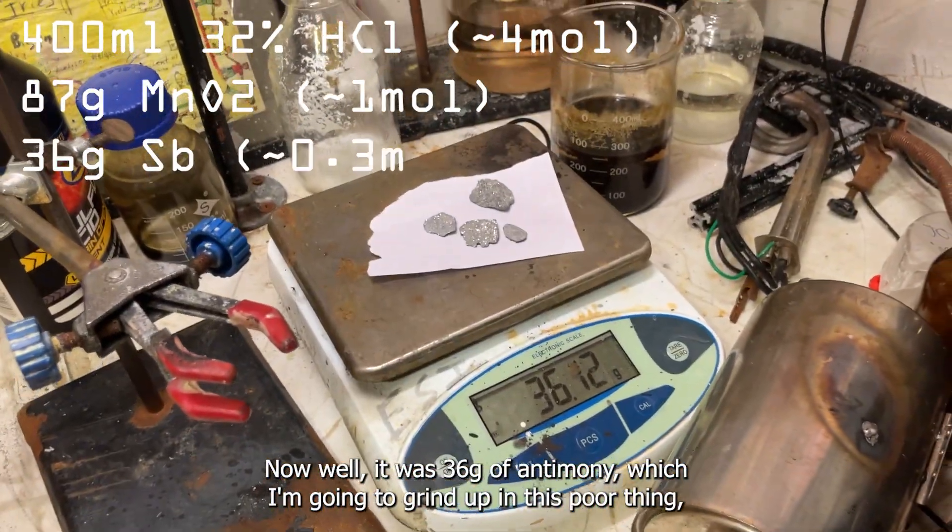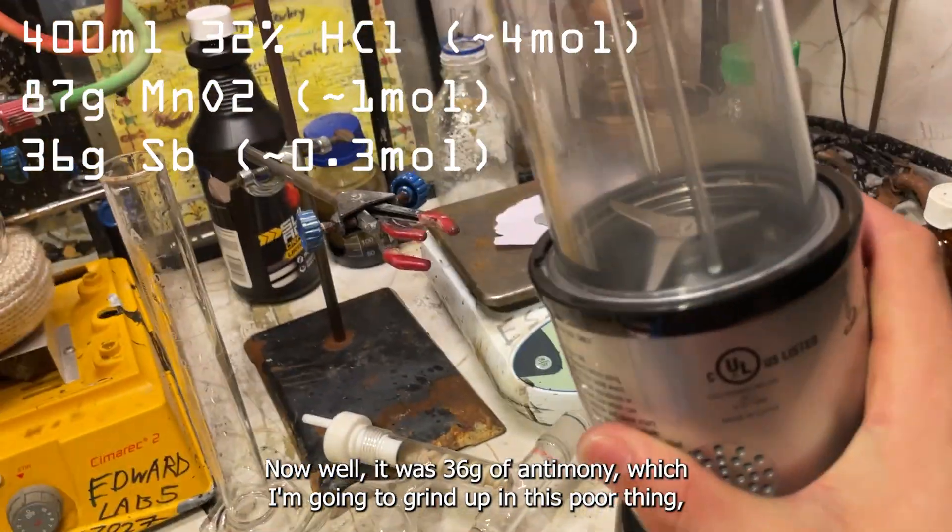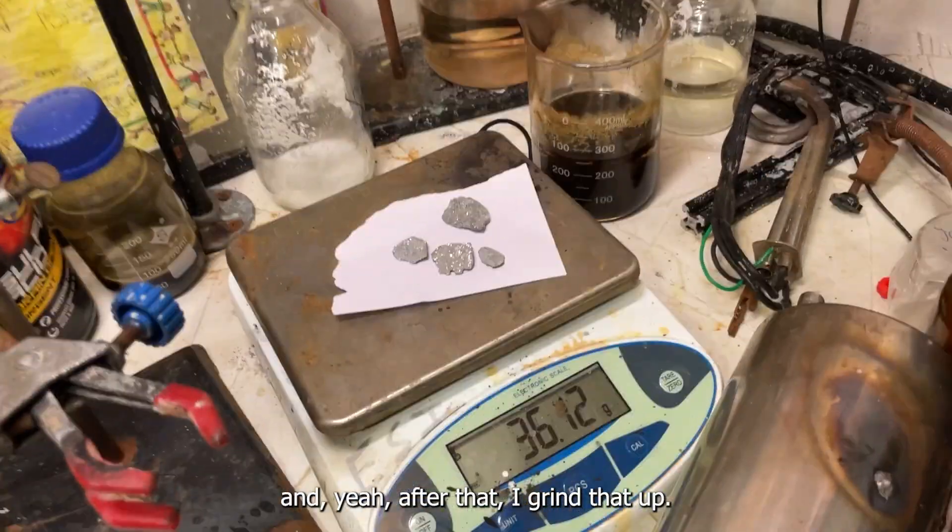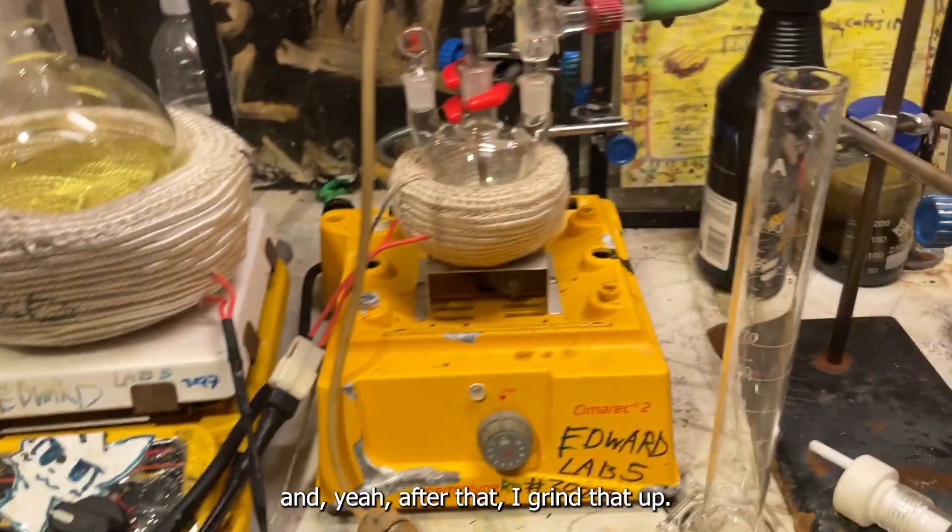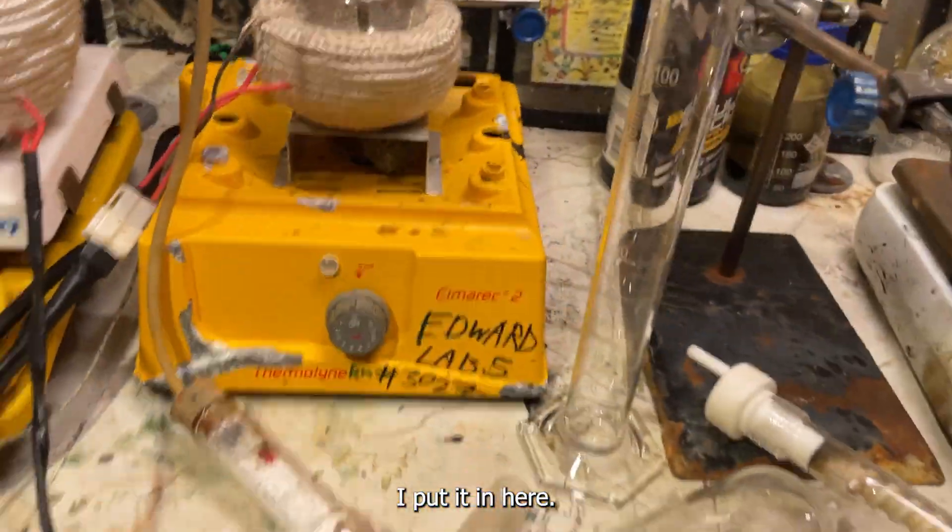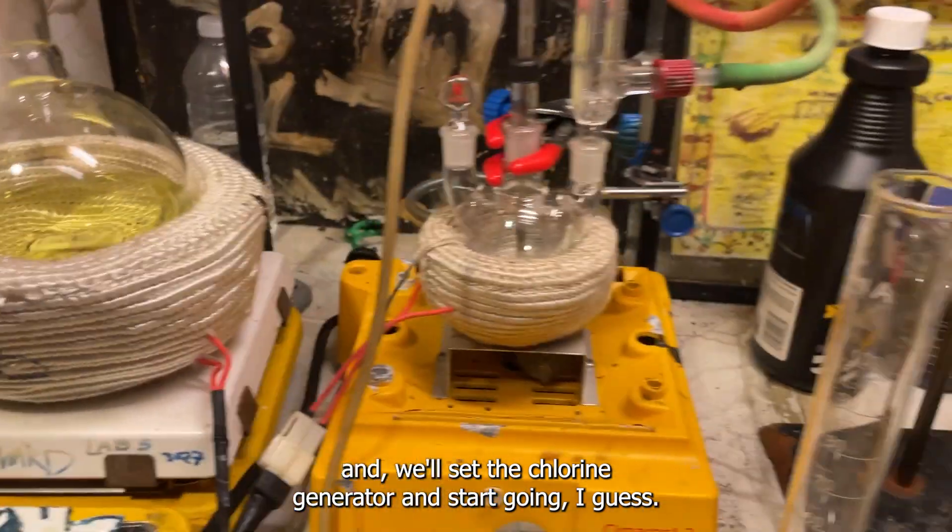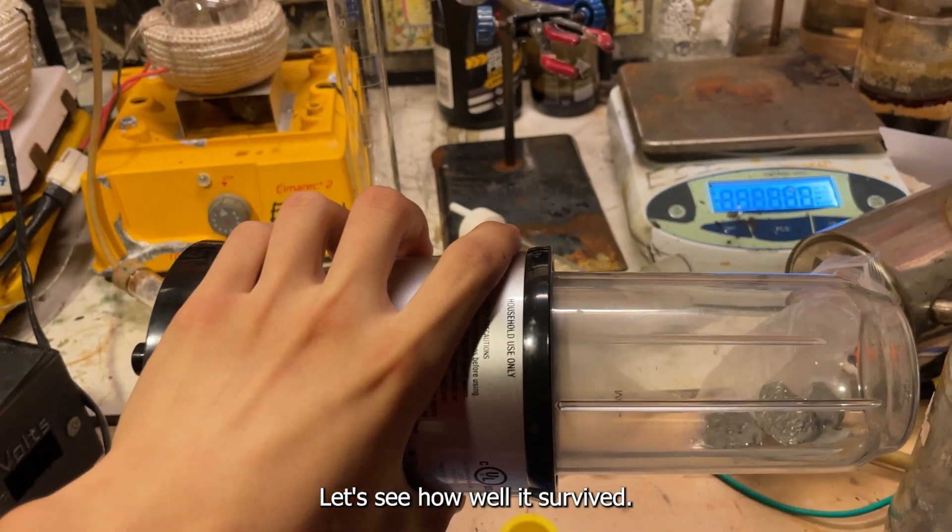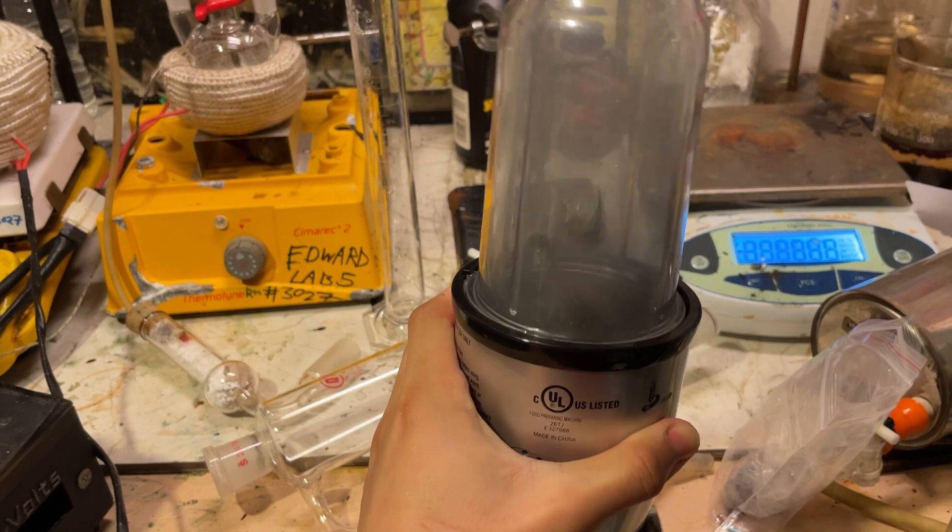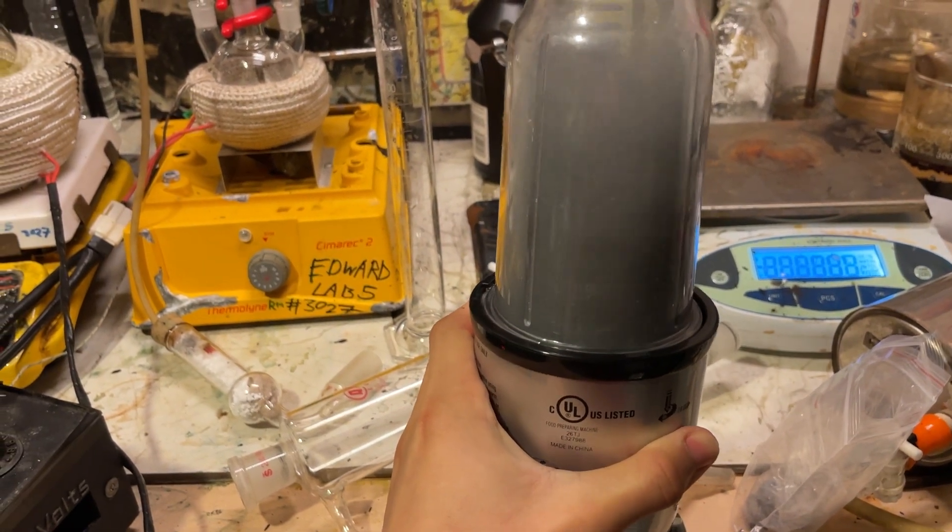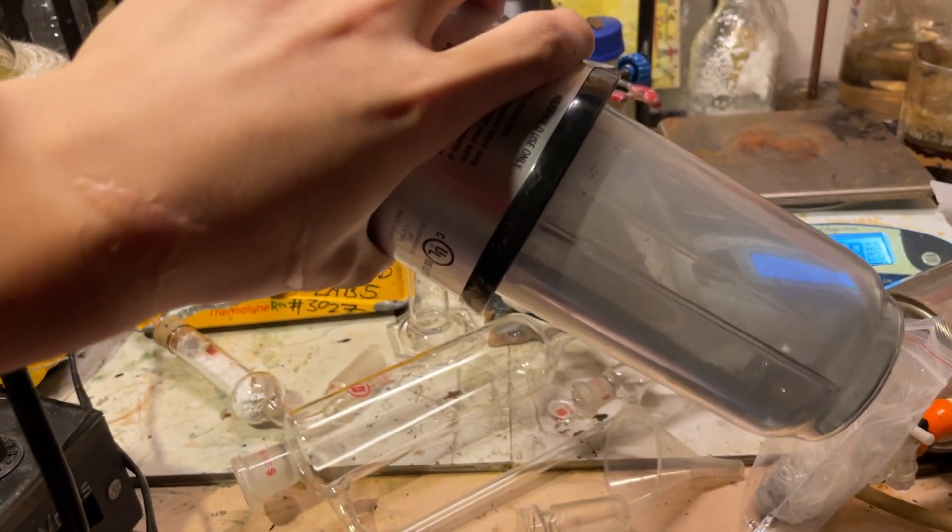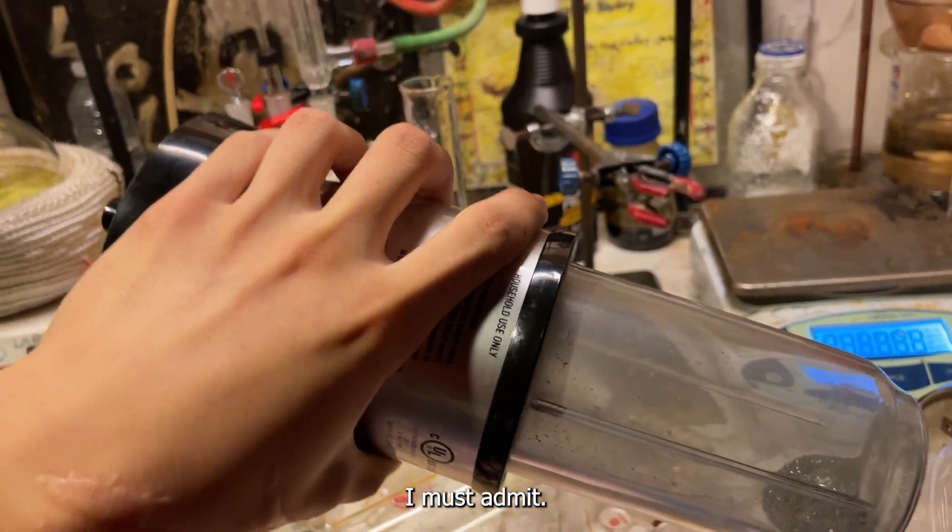Now we're going to use 36 grams of antimony, which I'm going to grind up in this poor thing to see if it survives. And after that, I grind that up, I put it in here, the flask is already preheated, and we'll set the chlorine generator and start going. Let's see how well it survives. That is quite perfect, I must admit.